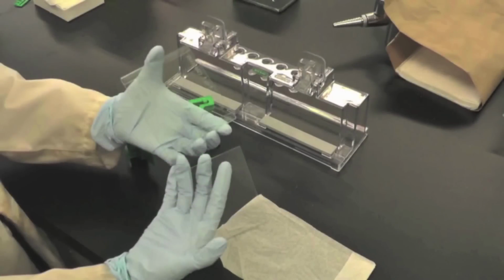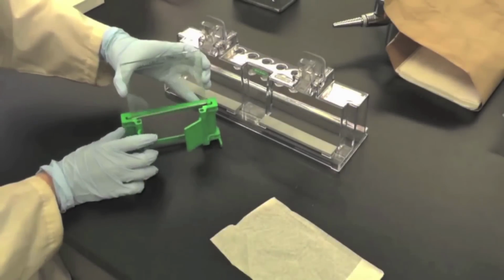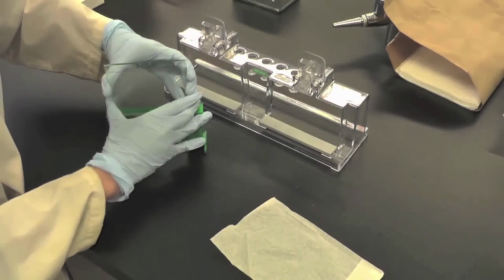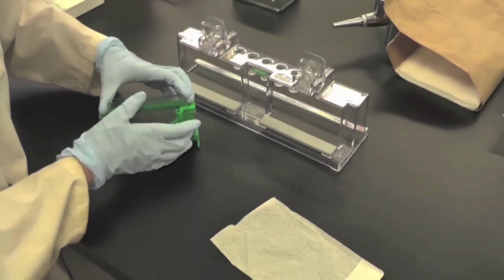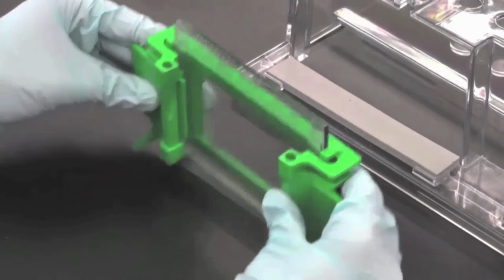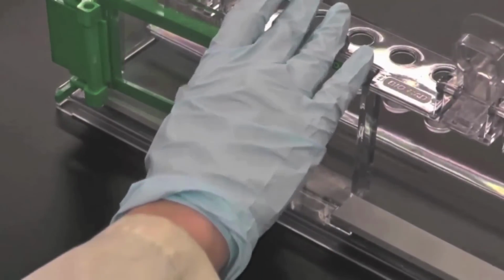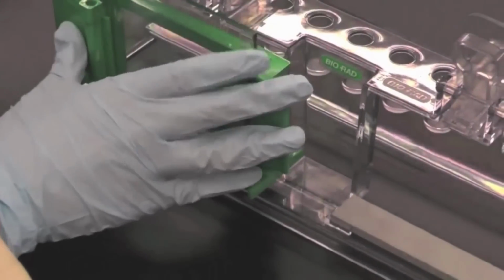First, insert a short plate and a 1mm spacer plate into the casting frame. Make sure the feet of the casting frame are on the bottom. Make sure the plates are also leveled at the bottom. Then tighten the clamp to secure the position of the plates. Next, install the casting frame with the plates onto the casting stand and ensure the setup is tight and secured.